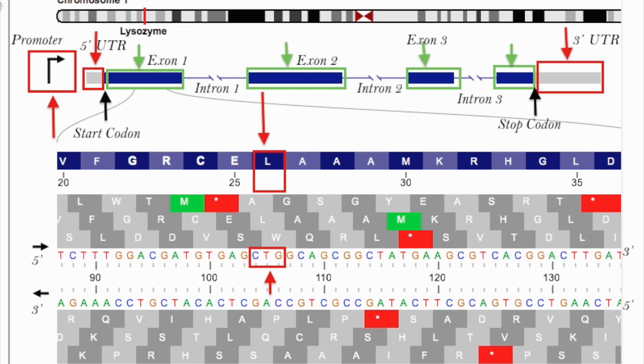So let's take a look at the sequence view. This down here, as I said before, is the sequence view. From just looking at the sequence view, you can tell the RNA polymerase goes from left to right, because you can see 5' to 3' and 3' to 5' based on where you're looking. From this, we can tell that the bottom strand is the transcribed strand, and the top strand is the coding strand.